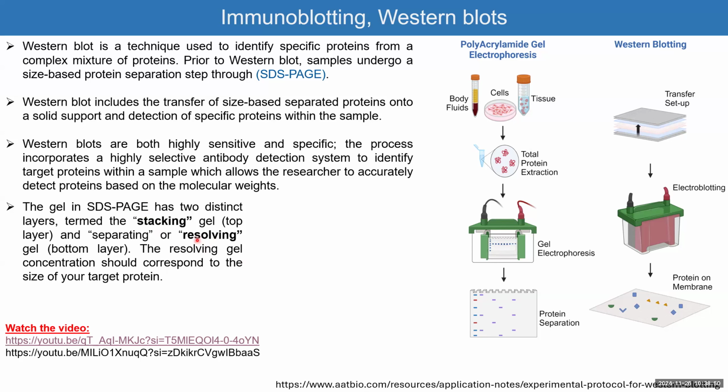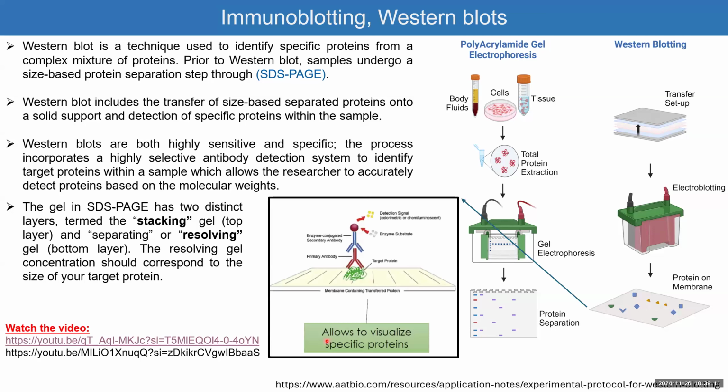So you have to be careful that resolving should be down in this part, and the stacking is somewhere on the top. Most of the time we throw it away before this step. So just keep this in mind. There is a very nice video here to show you how the Western blot and the SDS page are made.